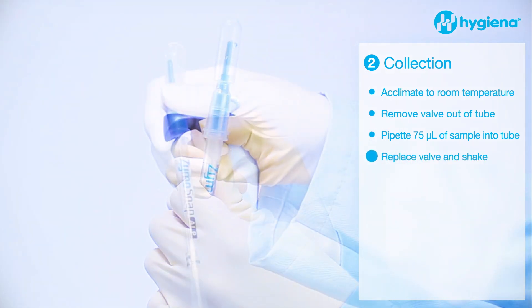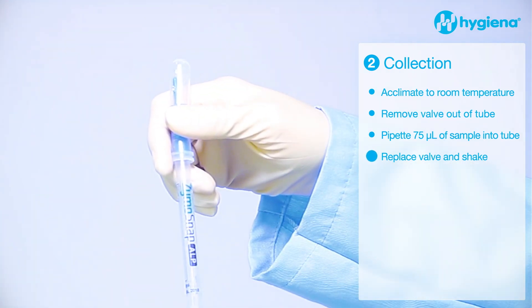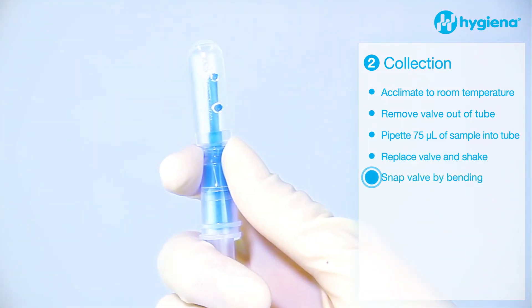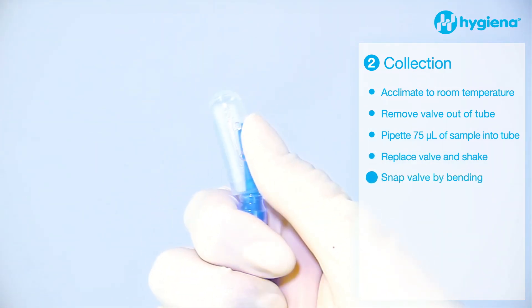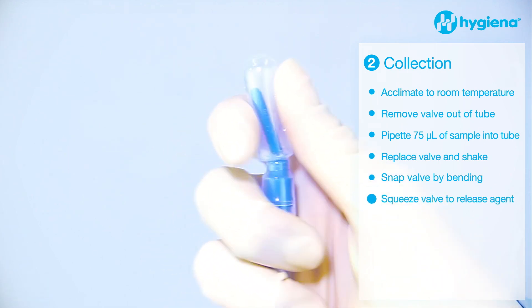Close and shake the device in downward strokes to ensure all of the sample reaches the bottom of the tube. Activate the device by bending the valve forward and backward to break the snap valve. Squeeze the valve to release the agent into the tube.